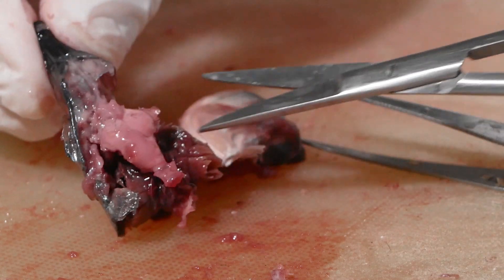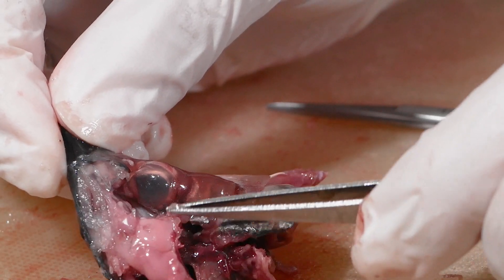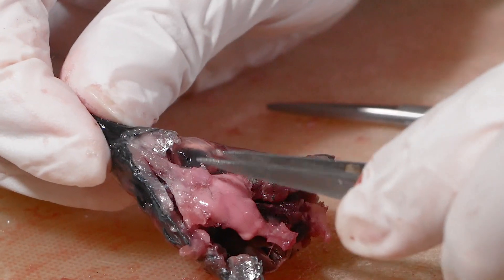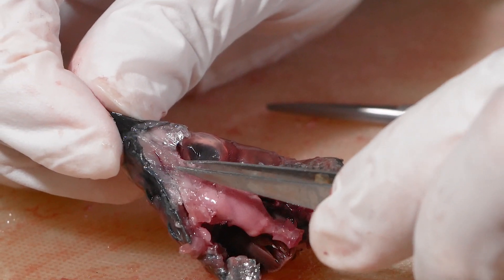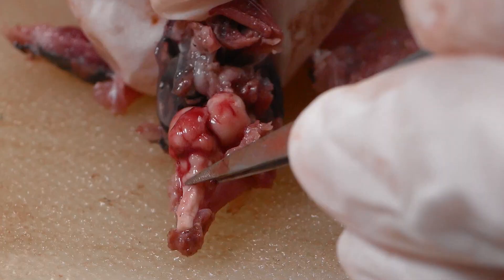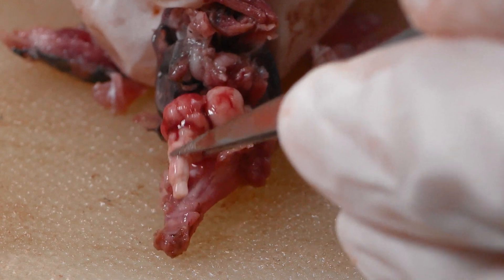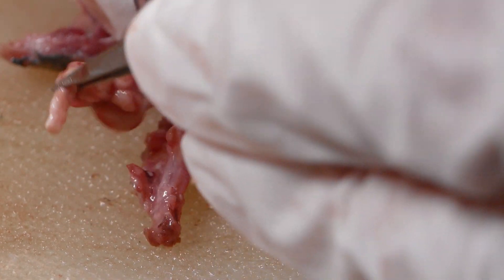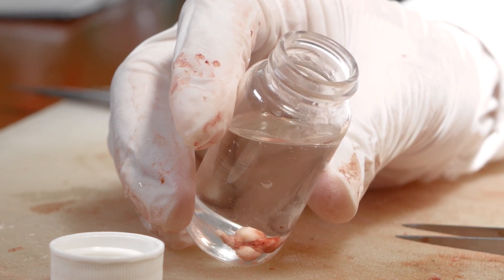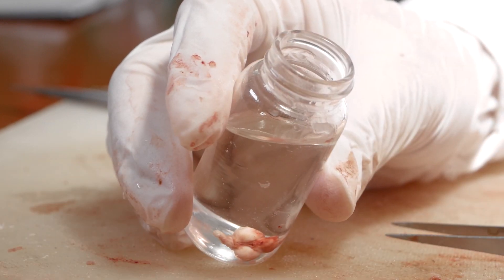Carefully remove the brain. However, if it doesn't come off readily, do not force it — the brain is probably still attached to the cranial nerves. Instead, try to expose the brain more. Once removed, place the brain in the vial containing 70% ethanol for preservation.